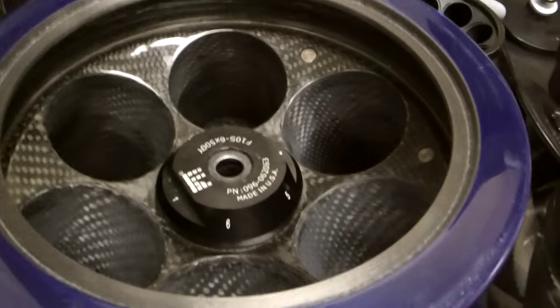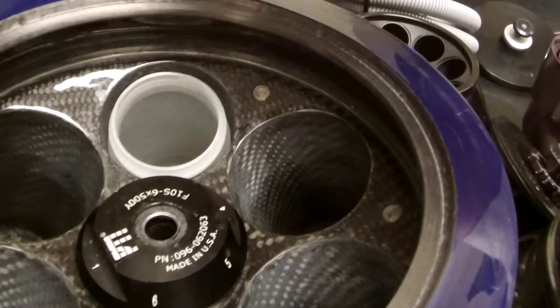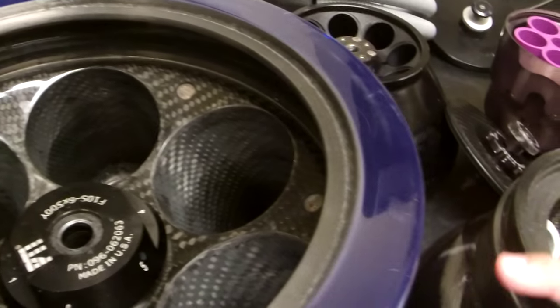In this centrifuge we only have 500ml bottles. If they don't fit right, you do not use them. If you're not sure, talk to your advisor.